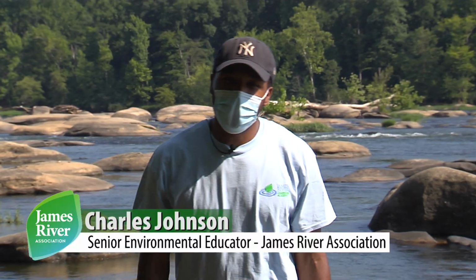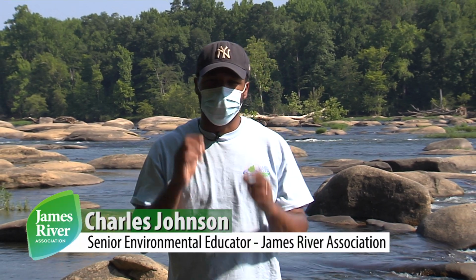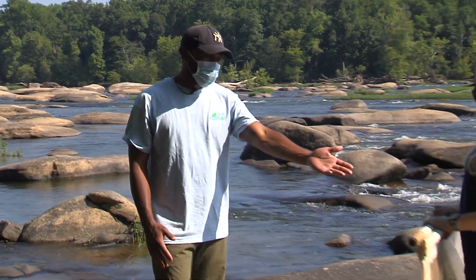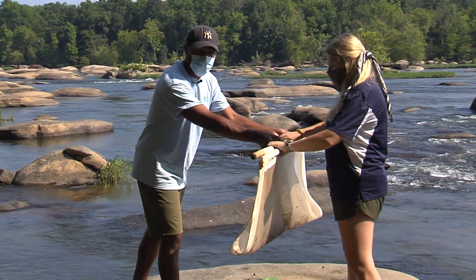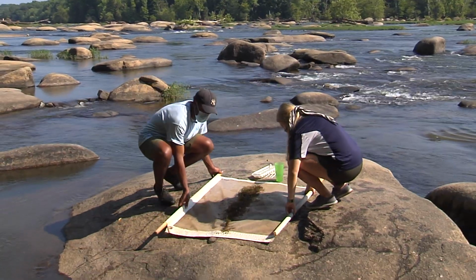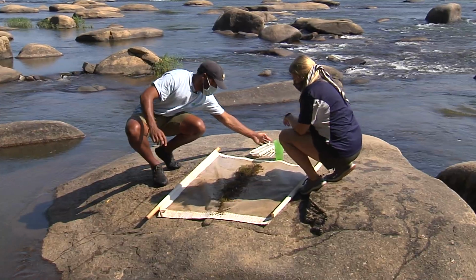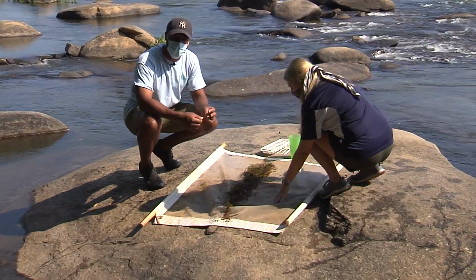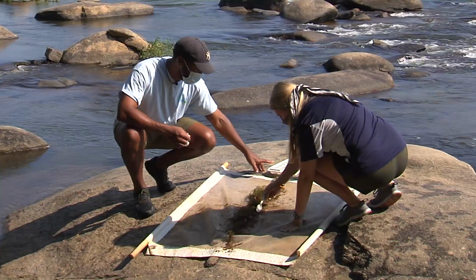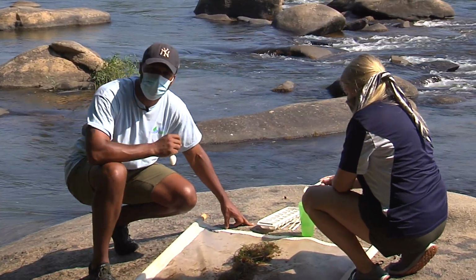Good morning. We are here today at Pony Pasture doing our macroinvertebrate water quality sample. We have our kick-seine net that we just collected our sample in, and we're going to look through to see if we can find any of those macroinvertebrates that we are looking for. We're going to use spoons so we can handle these organisms with care, and then put them into our ice tray so that we can use our observation skills to see what we have collected.